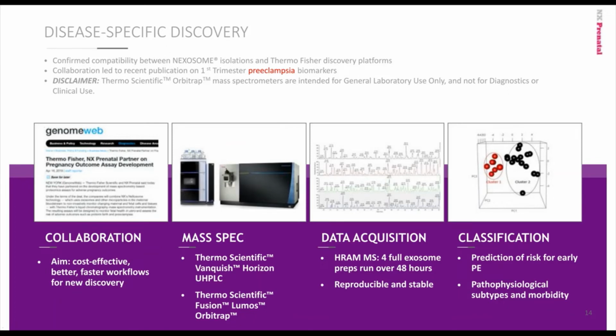I just want to point out with this slide that we collaborated with Thermo Fisher and its BRIMS on the preeclampsia project I'll talk about later in the talk. We did the particle isolations ourselves and then sent them those isolates. They did the MS discovery work analytically. Dr. Tom McElrath from the Brigham did the informatics and classification work. And we had some input from Dr. Zhang.